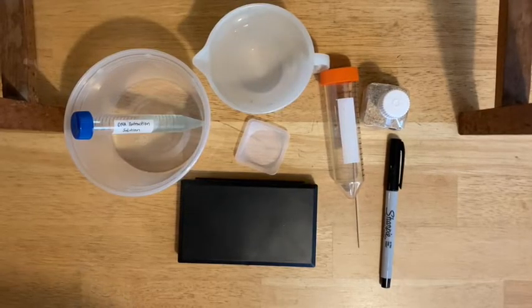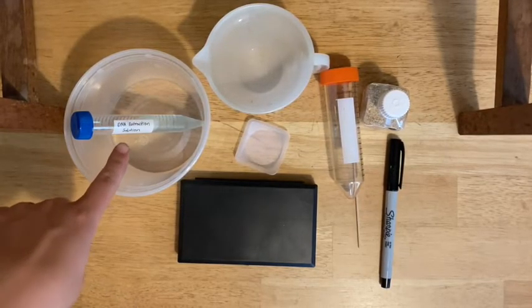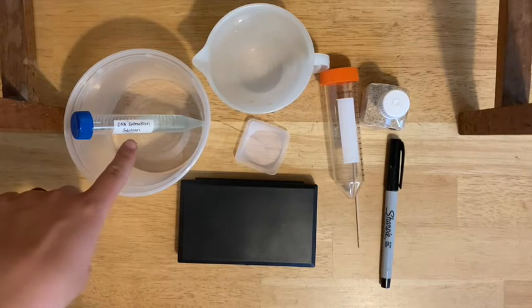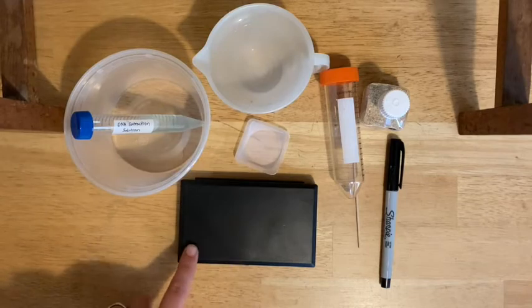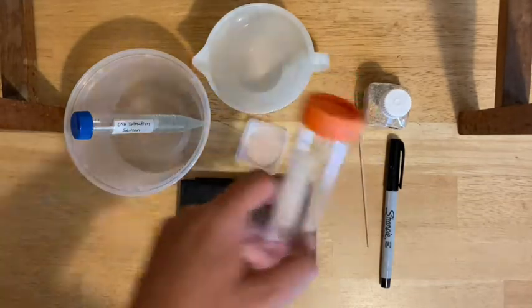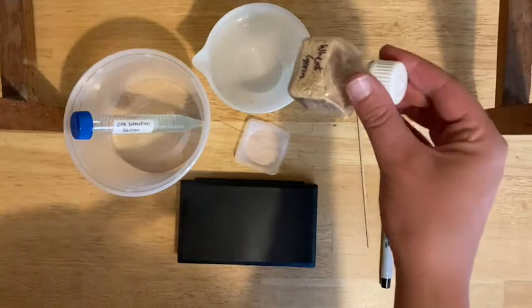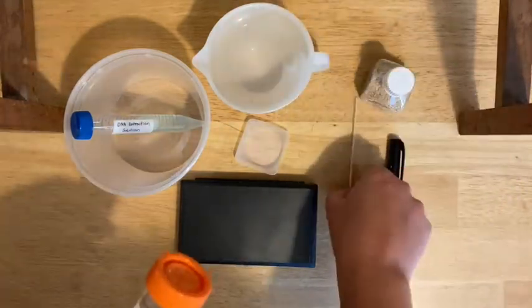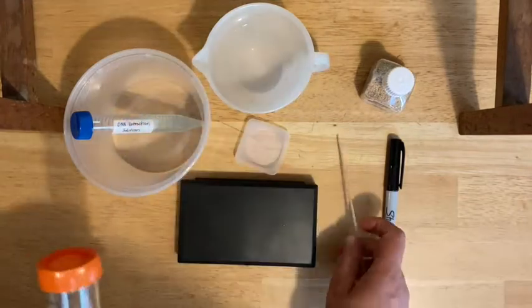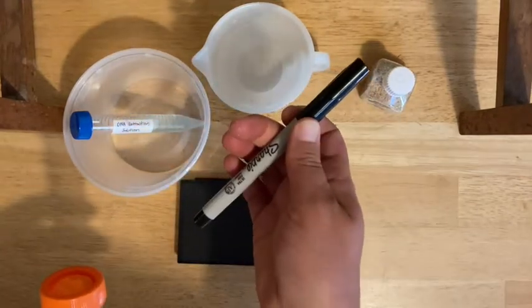Here are all the things you're going to need for this activity. You should have a DNA extraction solution or soap solution, water, a balance and a weigh boat, and a big 50 mL conical tube. You should have some wheat germ — it may or may not be pre-weighed, in which case you wouldn't need your weigh boat and balance. And then you should have a wooden stir stick and your Sharpie.